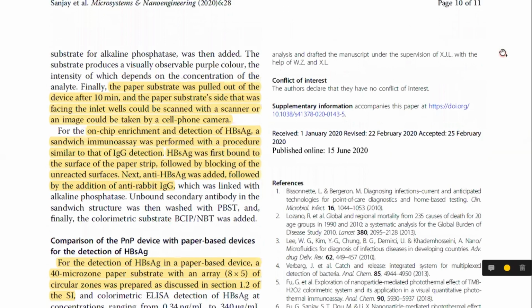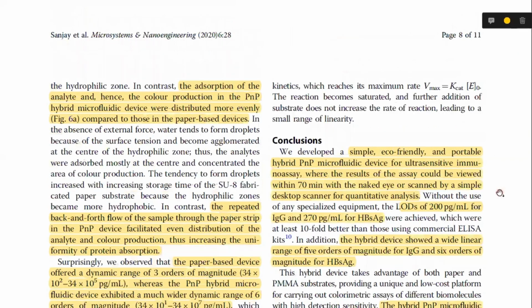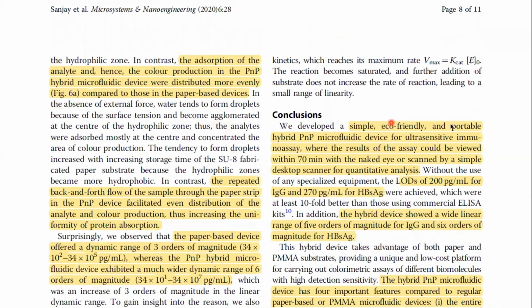The most important thing is that this device is a simple, eco-friendly and portable hybrid plug-and-play microfluidic device for ultrasensitive immunoassay. So it can be used again and again to perform quicker ELISAs, because the results can be viewed within 70 minutes, and it offers us the possibility to perform further quantitative analysis only using a desktop scanner and ImageJ software, not depending on expensive equipment such as a spectrophotometer.